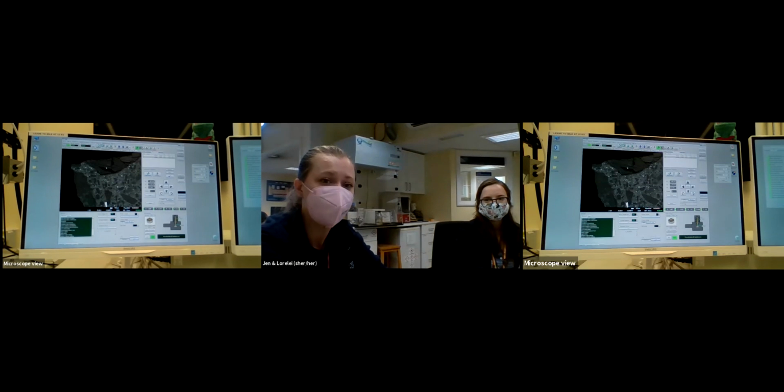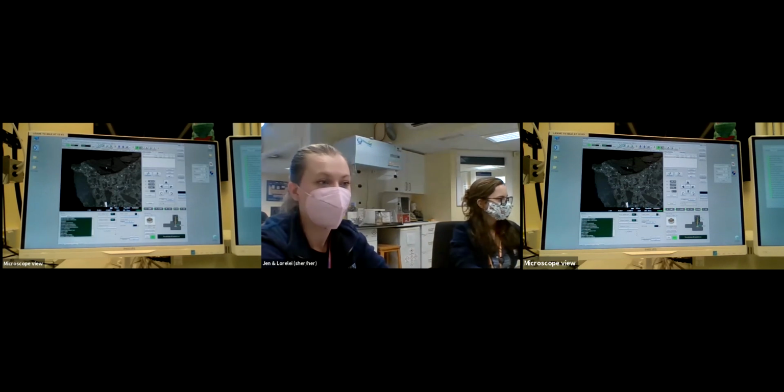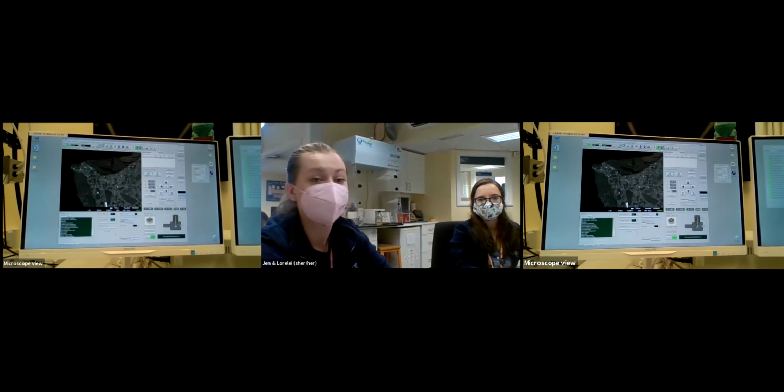So it's really useful for geology, because often we have rocks with lots of different minerals in them. They're all made up out of different things. So we can start telling what they are. This is a really good way for us to drive around a sample, have a look at things, and get a vague idea of what's going on.